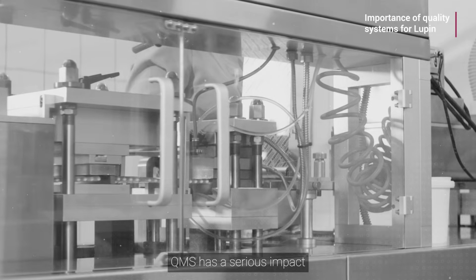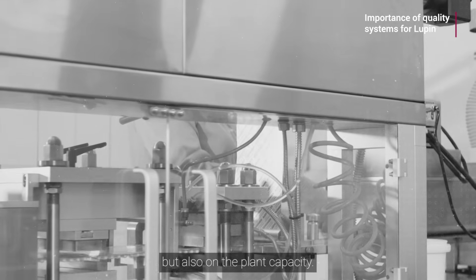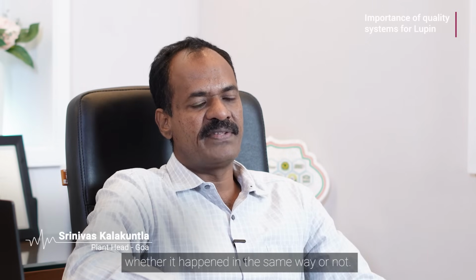QMS have a serious impact not only on the lab but also on the plant capacity, because if any OOS or OOT happens, we have to take up an investigation, then a hypothesis, and we have to prove whether it happened in the same way or not. During this time, we lose significant time of the analyst, laboratory, chemicals, everything is involved, and it becomes the bottleneck of the plant.